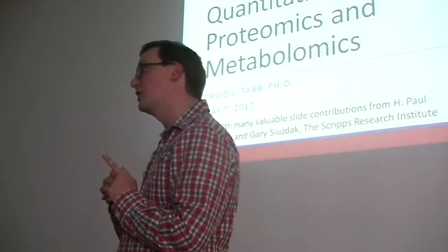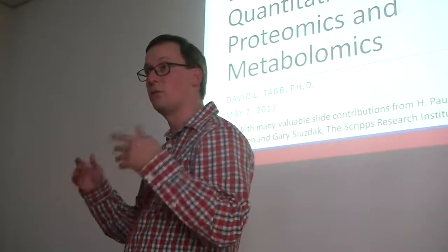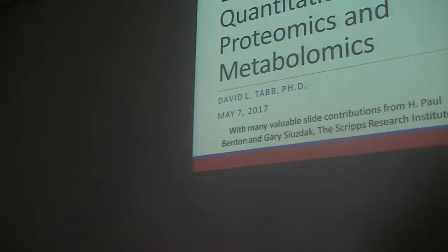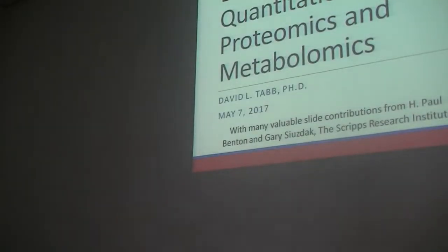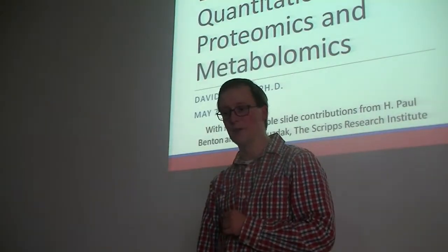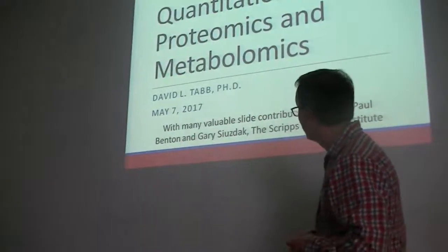We've talked about biomarker hunts before when we were dealing with data from, say, microarrays and genetic sequencing. But now we're looking at the recognition of metabolites and proteins, and that is, this metabolite and protein world tends to be something that we measure through liquid chromatography, mass spectrometry. So if you'll stay with me, we will discuss this field in that light.